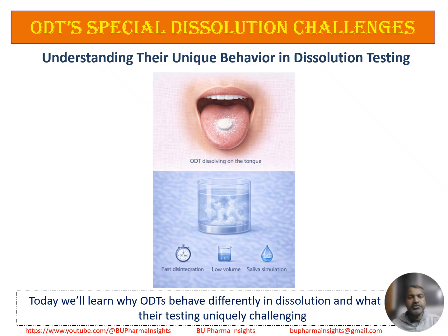Hi everyone, in this video we will discuss orally disintegrating tablet special dissolution challenges. Orally disintegrating tablets, or ODTs, are designed to break apart rapidly in the mouth using minimal fluid. Because of this unique design, their in vitro dissolution behavior is very different from conventional immediate release tablets.